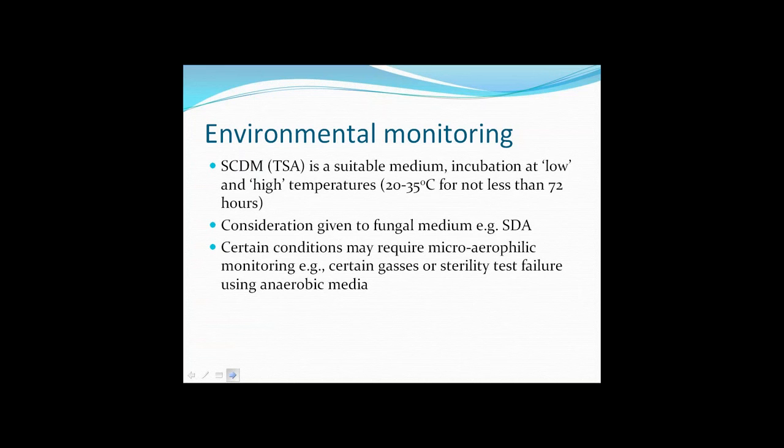However, usefully, the chapter does state that a fungal medium, such as Sabouraud dextrose agar, may be used if the recovered environmental flora suggests that such an agar medium is required. And obviously at the moment, particularly with FDA, the presence of fungi in clean rooms and controlled environments is a hot topic.